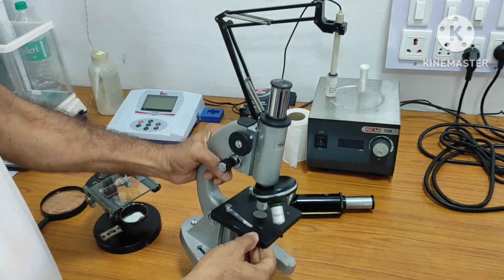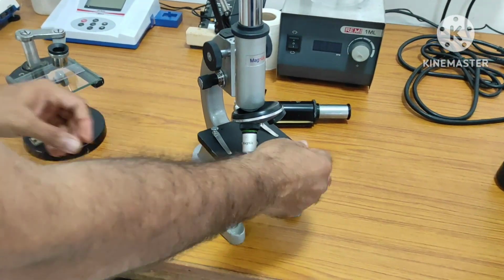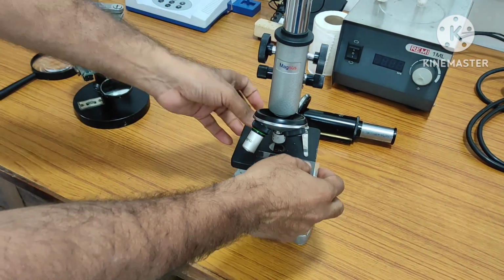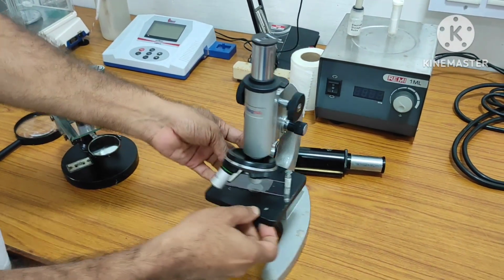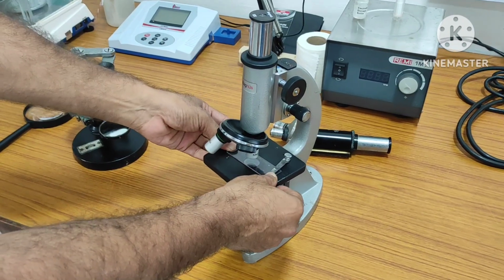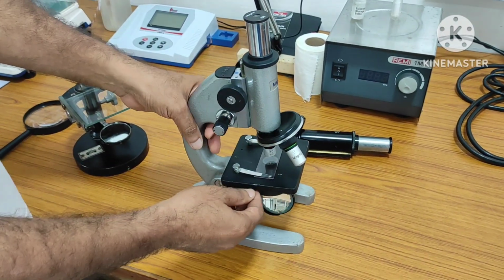With that, we can see here this part of the microscope is called as stage to put the slide, right? And to hold the slide, we have clamps here. These two steel things are called as clamps. Clamps used to hold the slide like this, right? So that slide won't move, specimen won't move while observing, right?